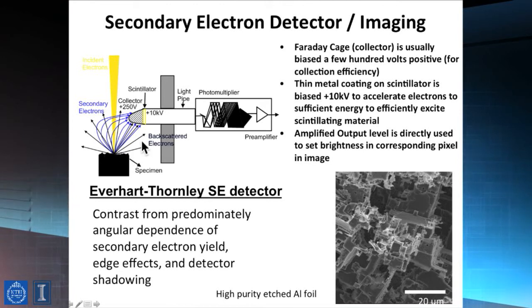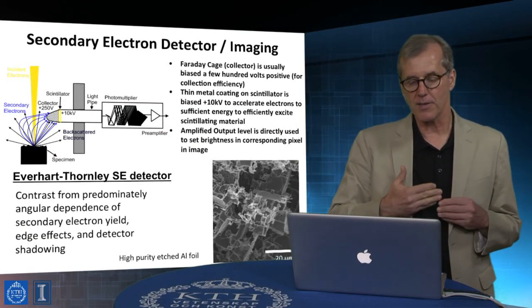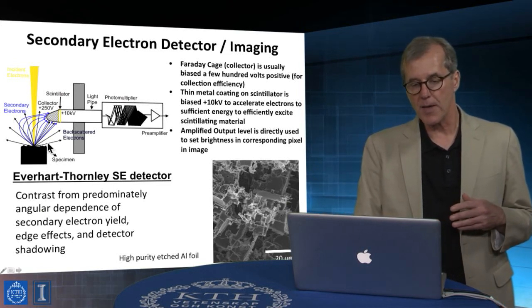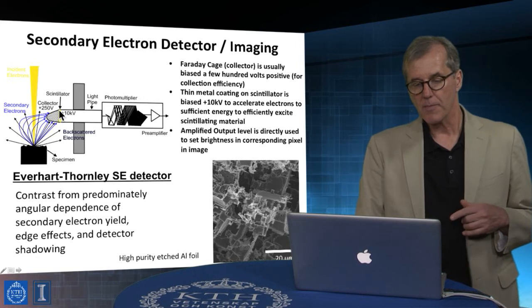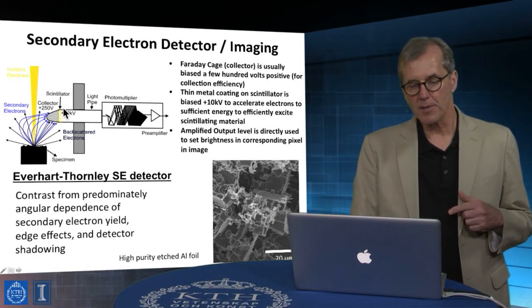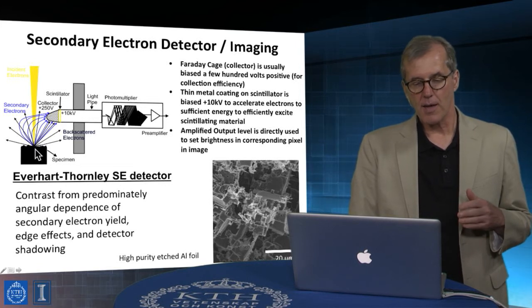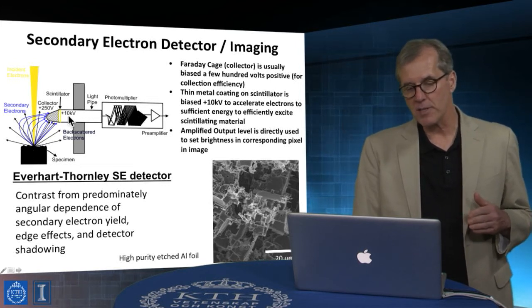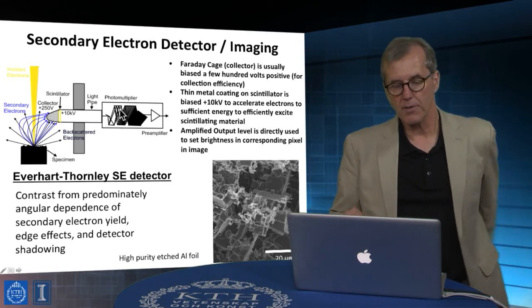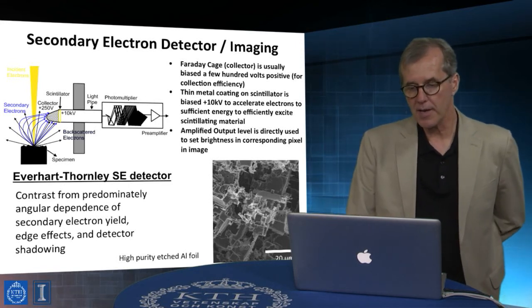And the slide here is showing, if you look at these blue traces, electrons that follow trajectories very much in line with the detector, but also ones that have to, in fact, be grabbed by the E field at the detector acceptance lens that actually pulls electrons and drags them back into the analytical region of the detector.